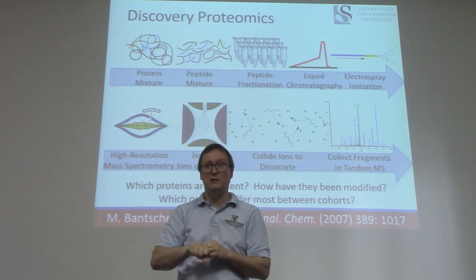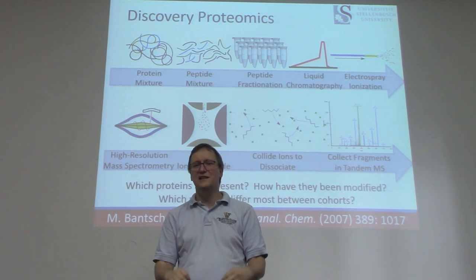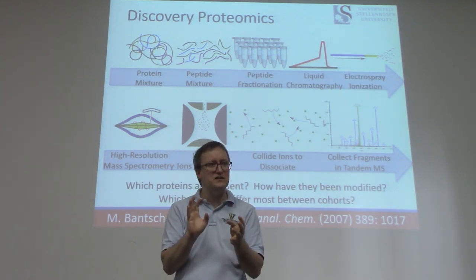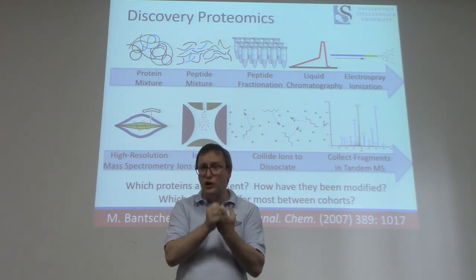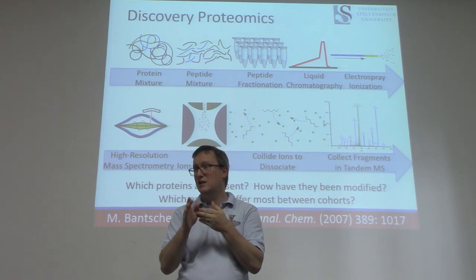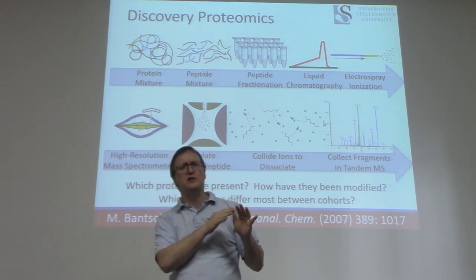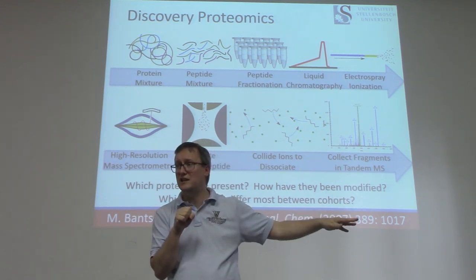Some of them are really greasy, right? They're just covered with leucines and isoleucines and valines. These are really hydrophobic residues, and those things stick really hard to those beads. Others, on the other hand, have a lot of acidic and basic residues, or some prolines, and these things don't stick quite as strongly to these beads. This difference in their affinity for these beads is what's going to allow us to separate them as a function of time. So we're going to start by flowing a barely hydrophobic solvent over these beads, and those that are least firmly bound are going to flow off at that time.